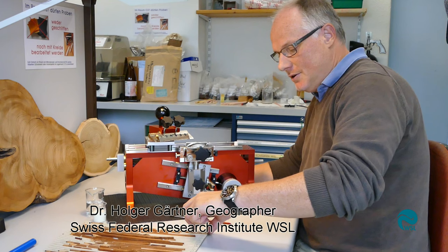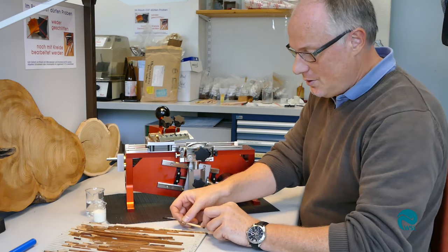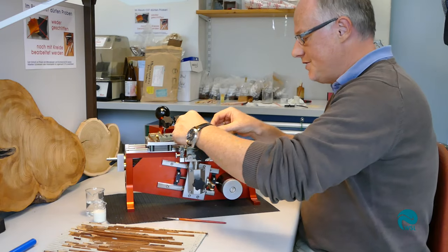In order to cut a micro section from a core sample, you take the sample and fix it in the holder of the microtome.